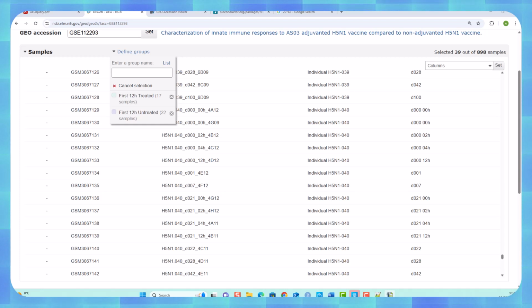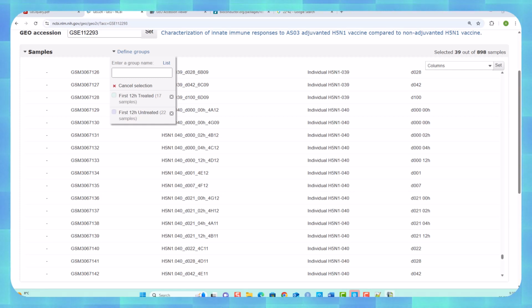So the ones that are missing are 2 that had the adjuvant and 1 that misses the adjuvant, and they didn't do any of the collections on the first one. I don't know what they did wrong. It's also, I'm not sure about the gender balance in the thing.